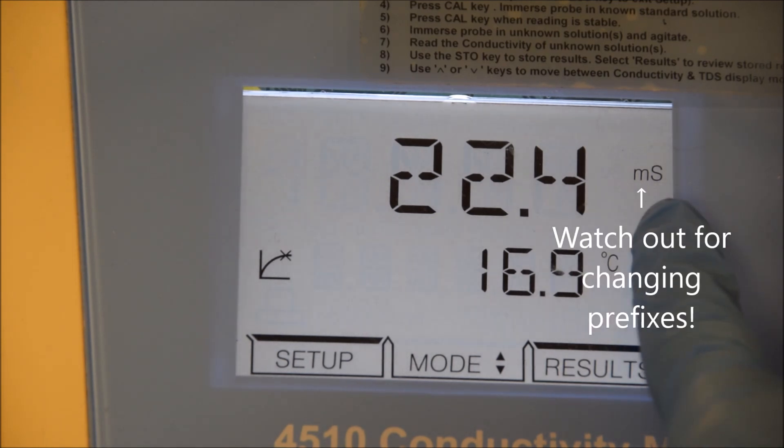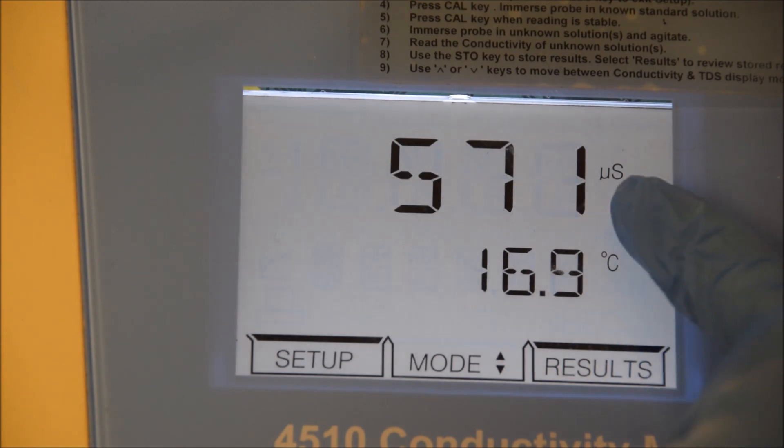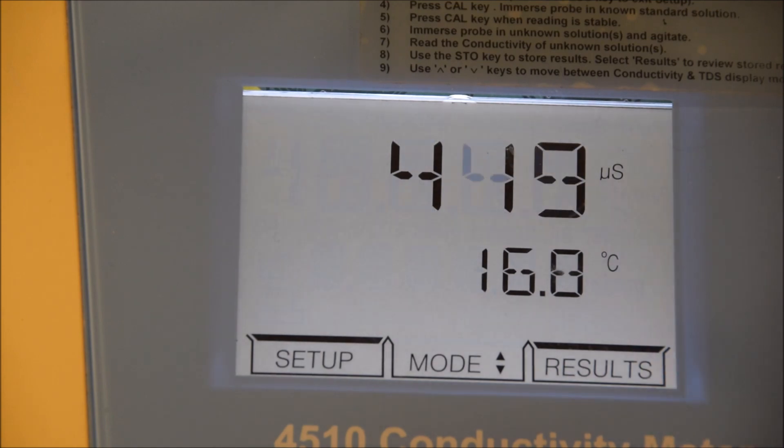What you have to notice here is that the prefix has changed. So it was in microsiemens per centimetre and now it's in millisiemens. And it can go back to microsiemens if we measure another solution. That will change as you take different readings, and you have to be careful to observe that because that's a thousand-fold difference.